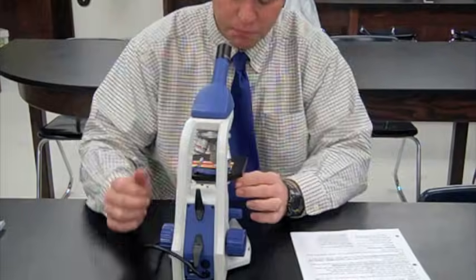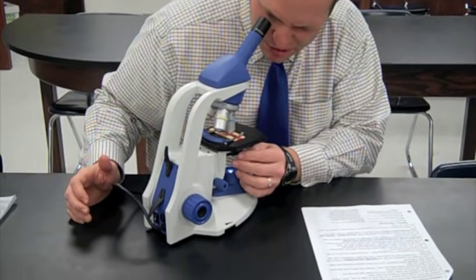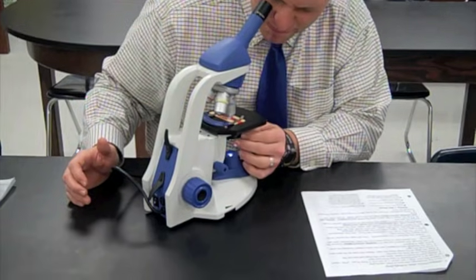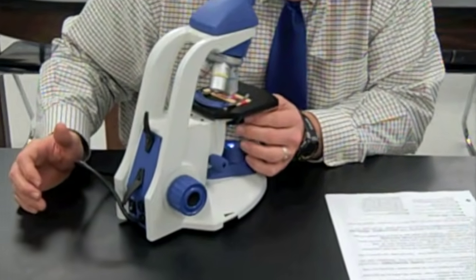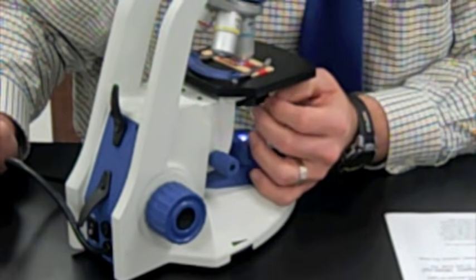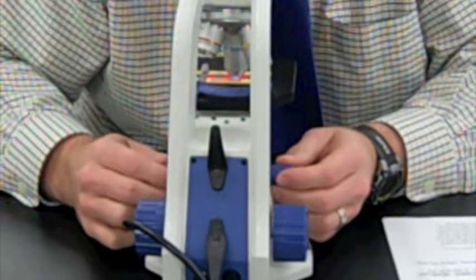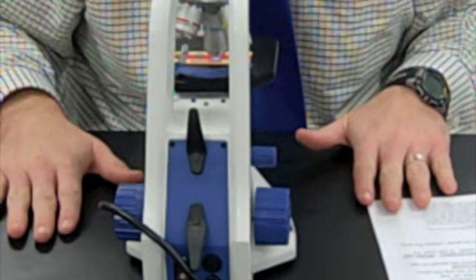Okay? Now at this point you may need to adjust the diaphragm to get a better resolution because of the light. Some specimens appear better in the dark light, where some appear better in the bright light. It's up to you to figure that out. Good. Now there's the best resolution I have right there. My slide is focused, I can draw it, and I'm pretty much set at this point.